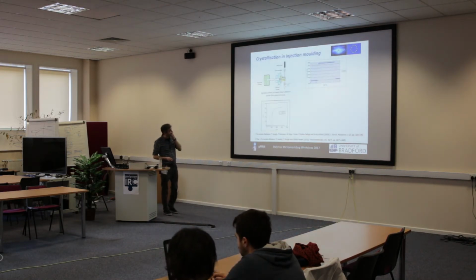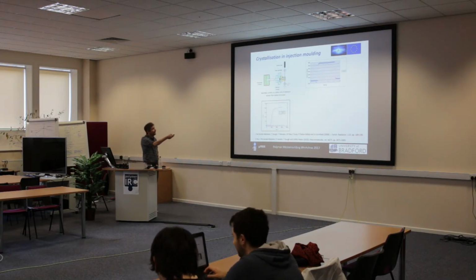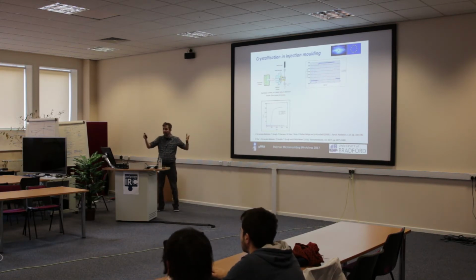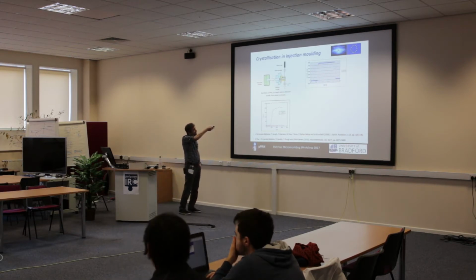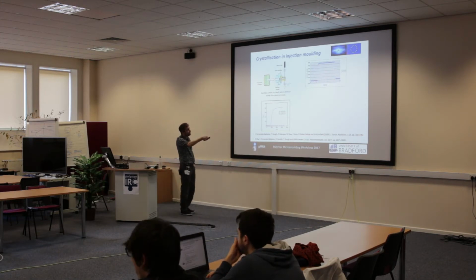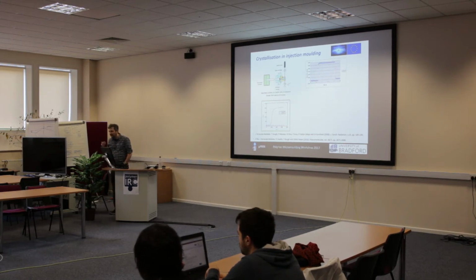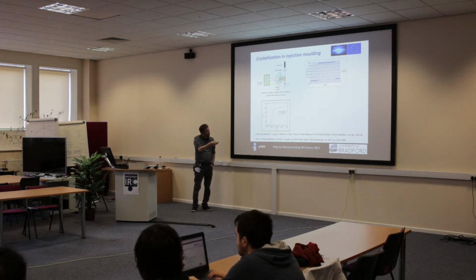One way we did it was taking an injection molder and putting it into the system. We took 800 kilograms basically of kit and put it into the beamline, heated the material up within here, and injection molded it into this very small region and put the X-ray through it. So this is our pressure pulse. We've got this massive pressure pulse. So basically we're flowing the material at the same time as crystallizing it. And this is a typical effect.